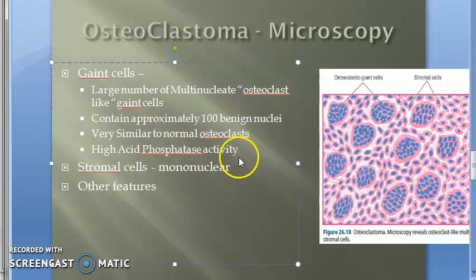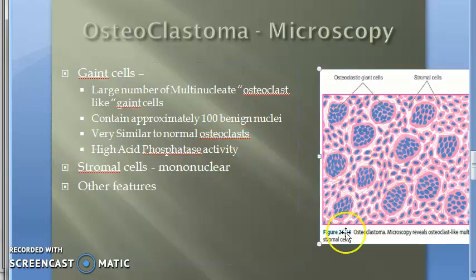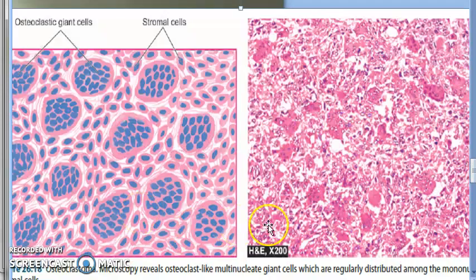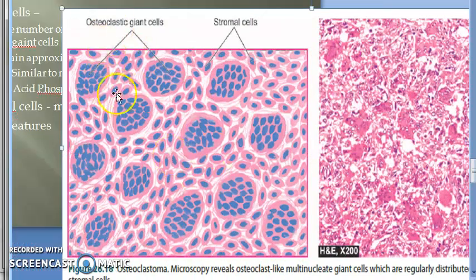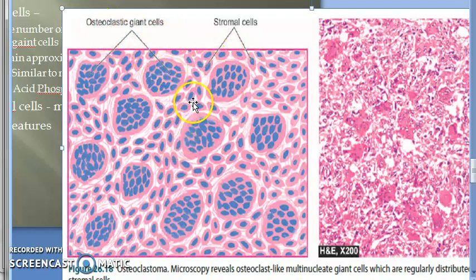Now looking at stromal cells — we already know these are mononuclear cells. Look at this diagram: osteoclast-like giant cells and stromal cells which are mononuclear. These stromal cells are the real tumor cells. Their histologic appearance determines the biologic behavior of the tumor.